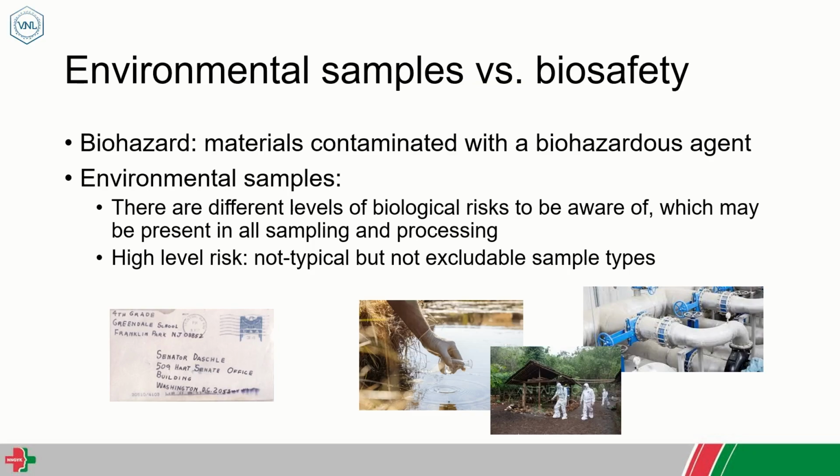So about environmental samples, I think we should consider two aspects in connection with biosafety. First, there is or there could be some level of biosafety risk in connection with every sample or every sampling event if it's not done properly, so if the national or international regulation standards or good practices are not followed.